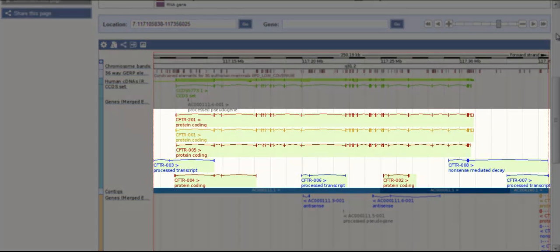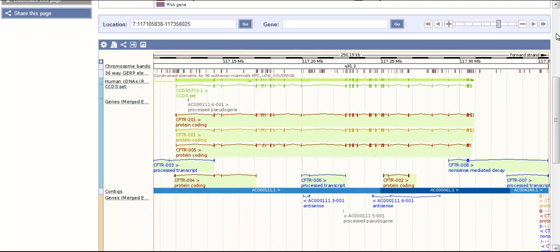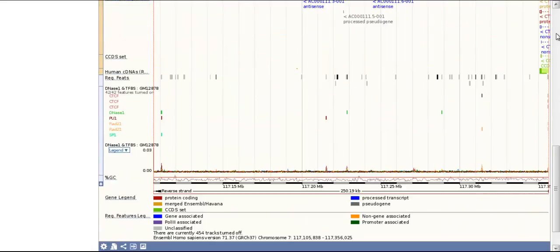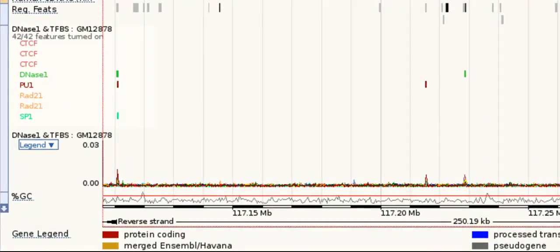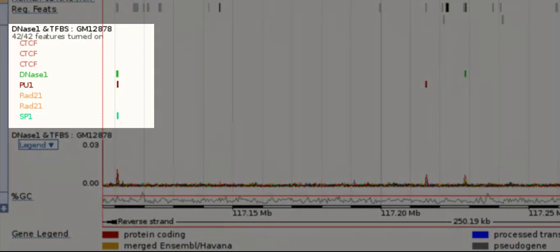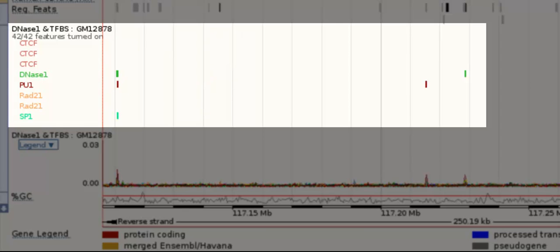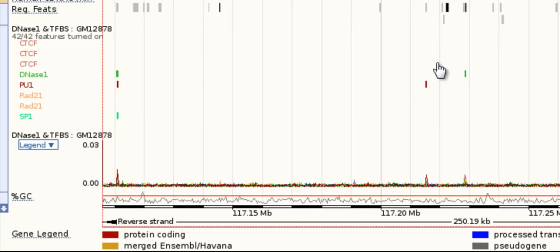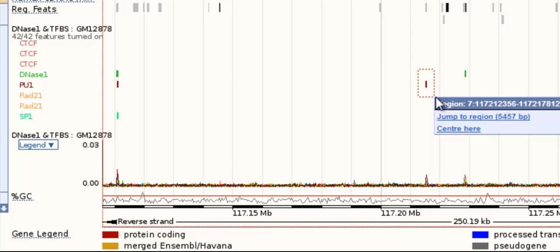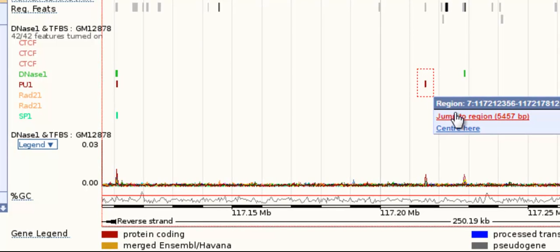In this particular region for the CFTR gene, I see DNase1 hypersensitivity, CTCF binding sites, PU1, RAD21, and SP1 binding sites across multiple experiments. Zoom in to one of these by drawing a box around the feature.